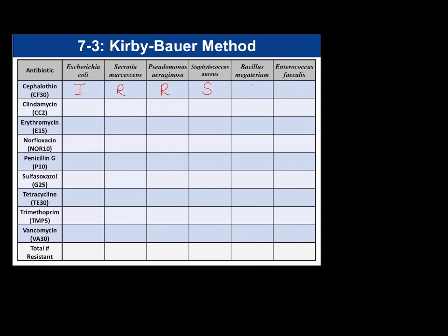We have resistant, sensitive, and intermediate resistant. For clindamycin, we have resistant, sensitive, resistant. Erythromycin, we have resistant, sensitive, intermediate.